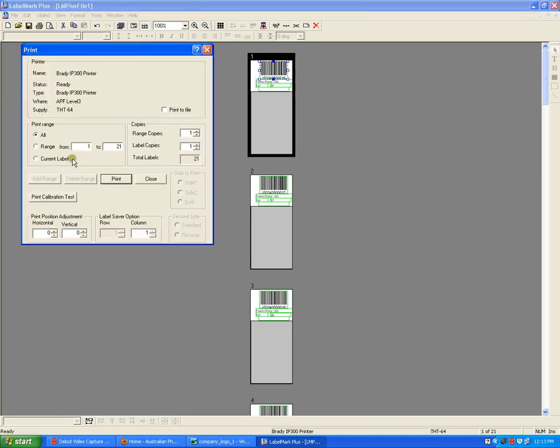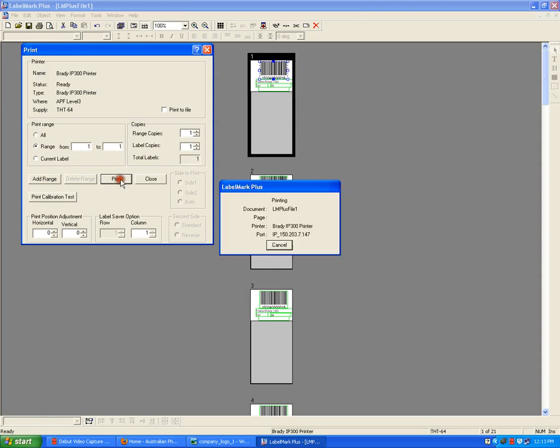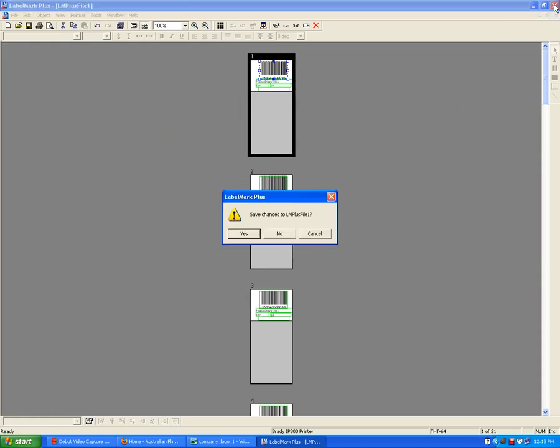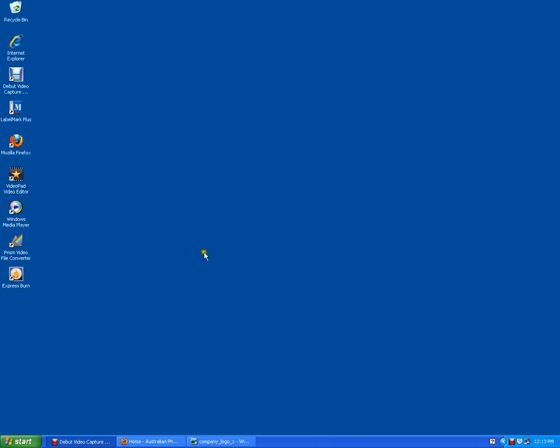File print, or you can select a certain range if you just want to click on one, however many. And if you have hundreds of them in there, if it's coming from one plate, you'll have a maximum actually of 96. And just click all print. Just do one, print. That's it. Close everything down when you're finished and turn off the computer. You don't have to save changes. Done.